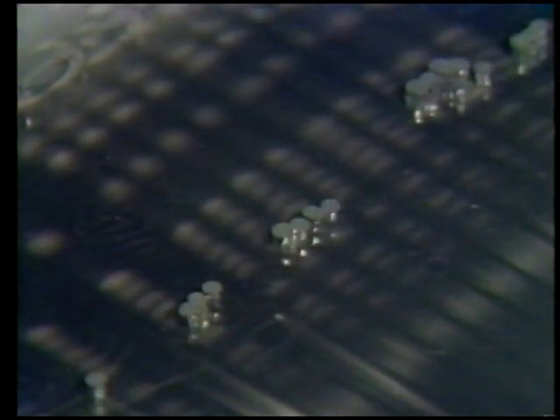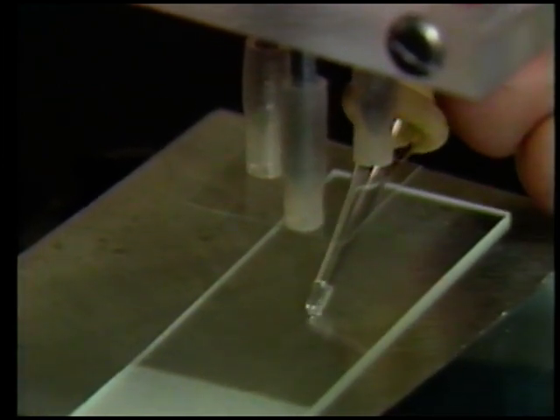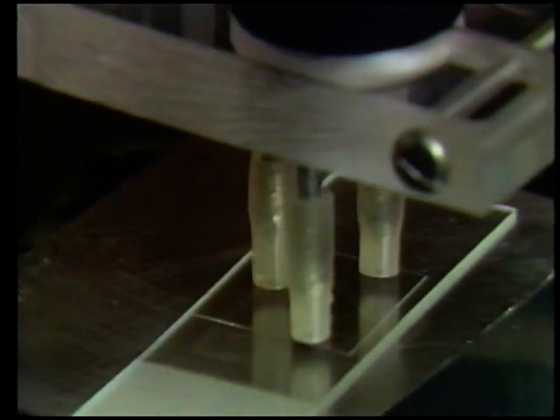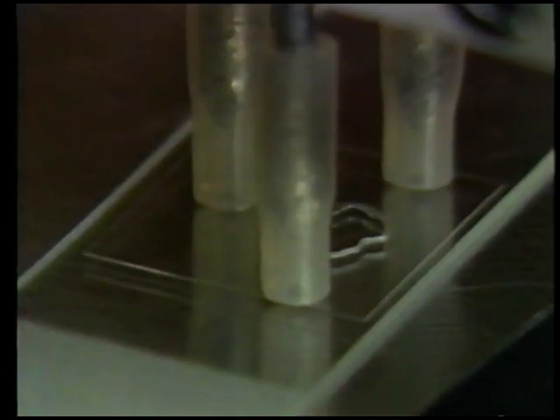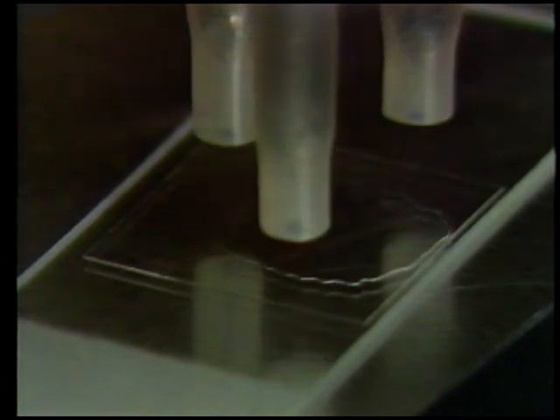And then I transfer it to the heated block microscope slide and squirt it out and slowly lower the cover glass. This is low melt agarose, and it will remelt at about 50 degrees C on this block and spread out underneath the cover slip.